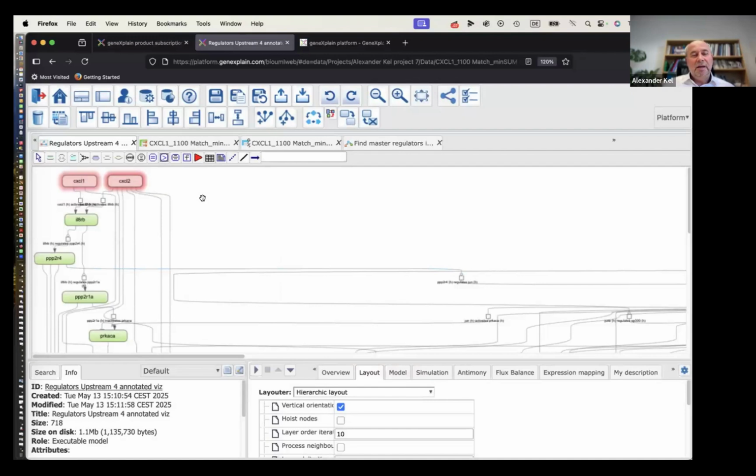And basically, just try your platform account, and you will be happy to do the next step: to not just find your binding sites, but really to find master regulators. And all this is free. You can just do it from what is available and what is provided.